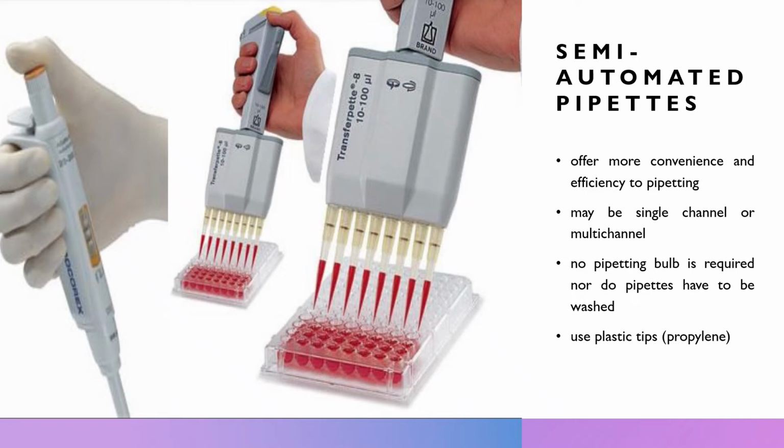The term automatic, as used here, implies that a mechanism that draws up and dispenses the liquid is an integral part of the pipette. It may be fully automated or self-operating, as what we have seen inside the automation machines used to aspirate blood samples. So inside the machines or equipment in the laboratory, there are automatic pipettes there. They dispense the sample on their own, so that's fully automated or self-operating.